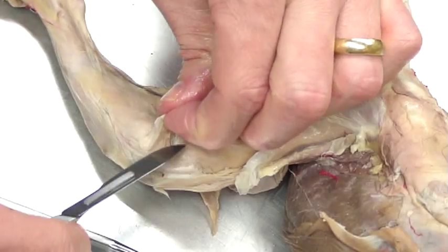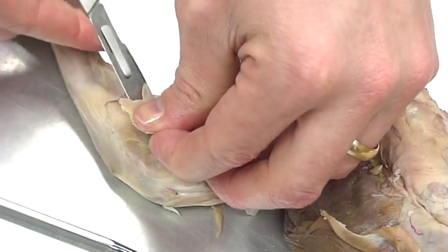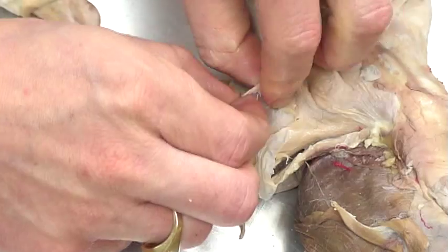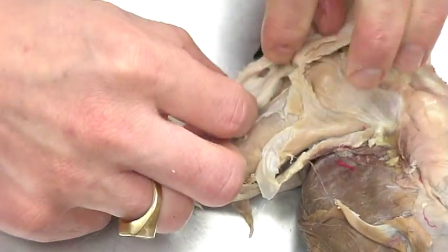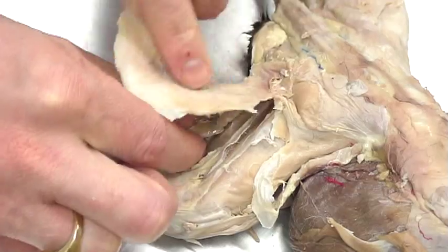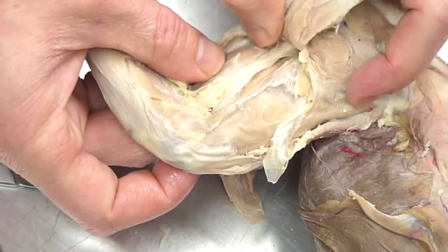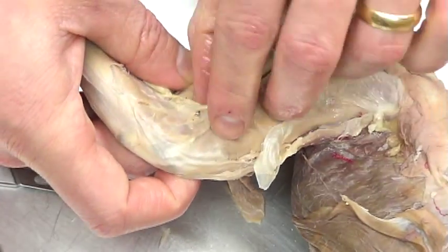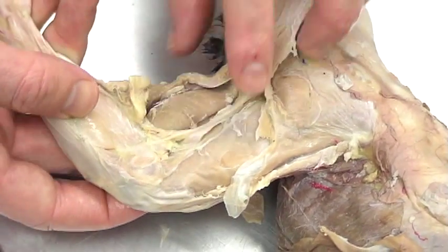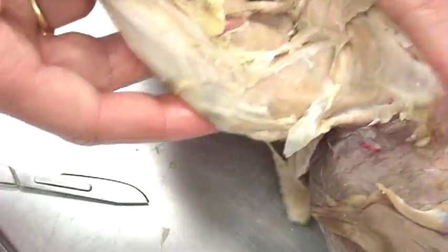I'm going to follow along the ridge of the biceps femoris at the distal end and reflect it up to the proximal. When we do that, we're going to see some fat and fascia, and we're going to see this muscle directly underneath the biceps femoris — this muscle is the semitendinosus. Don't worry about identifying the semimembranosus or adductors from this side. When you lift up the biceps femoris, you'll want to find the semitendinosus.